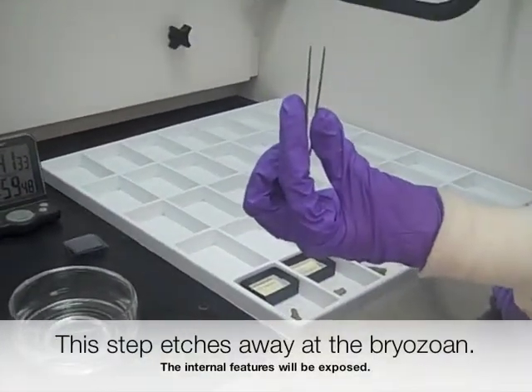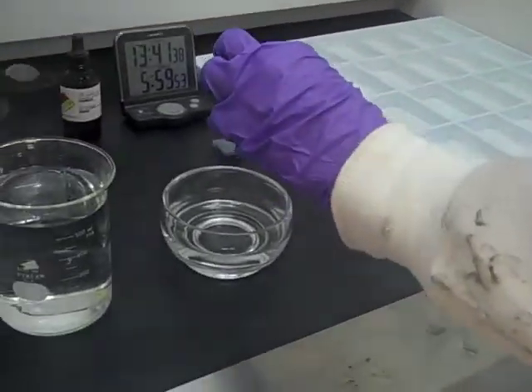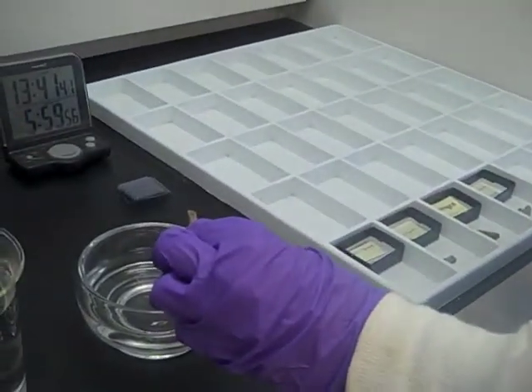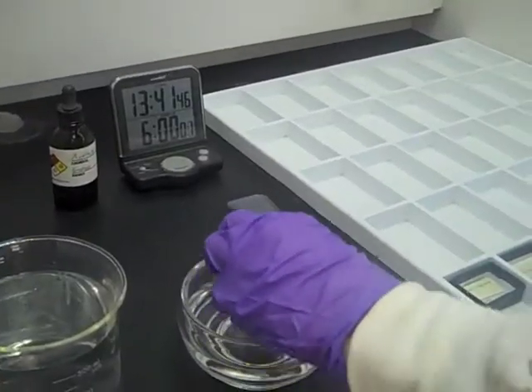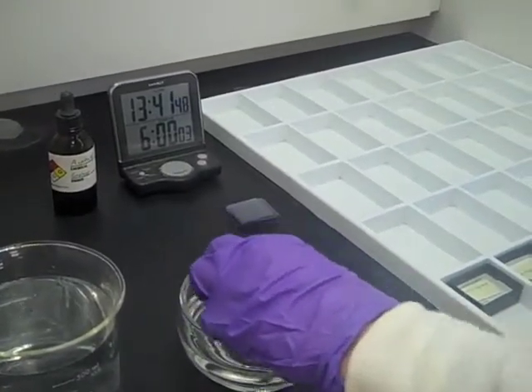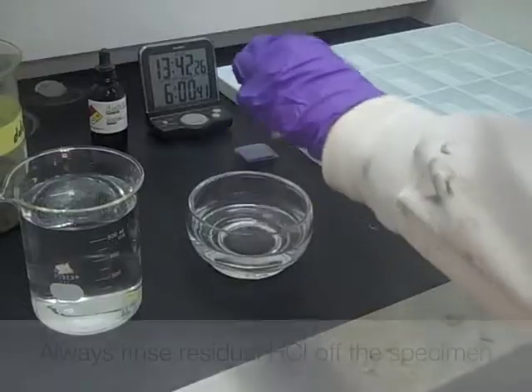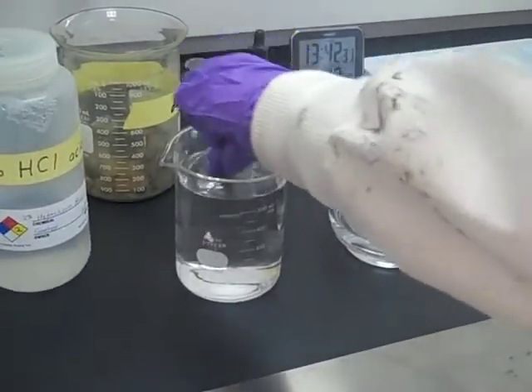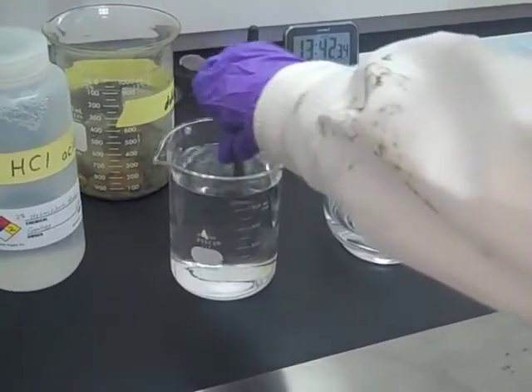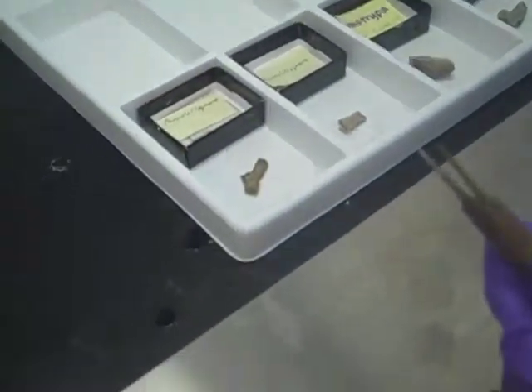We're going to use some tweezers and pick up the bryozoan, and we're going to put it in the acid for at least 15 to 20 seconds — starting the timer at 35 seconds. You want to swirl it around. Next, you want to rinse it off in the water for about 10 to 15 seconds, and then set it down face up.